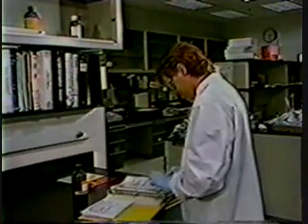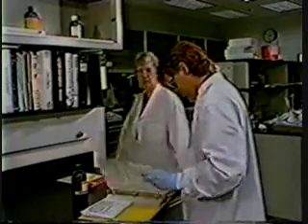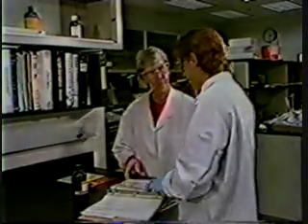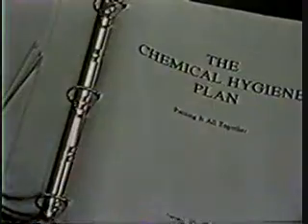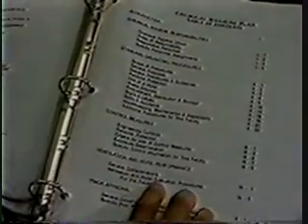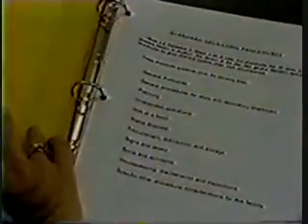As you know, OSHA's Hazard Communication Standard helps ensure that we get the information and training needed to work safely with hazardous chemicals. OSHA's laboratory standard goes one step further by requiring employers to maintain a chemical hygiene plan. This written program identifies the procedures and equipment that are used to protect employees from hazardous chemicals.